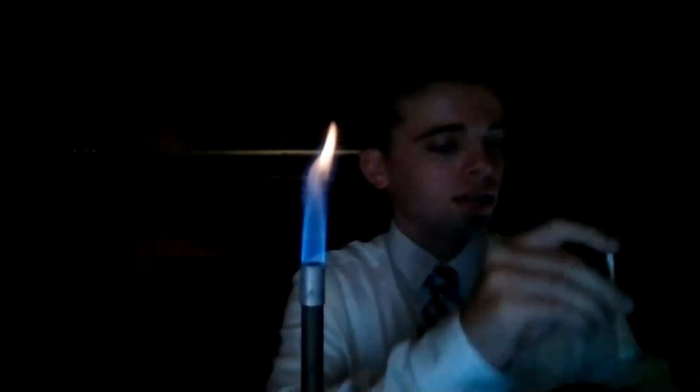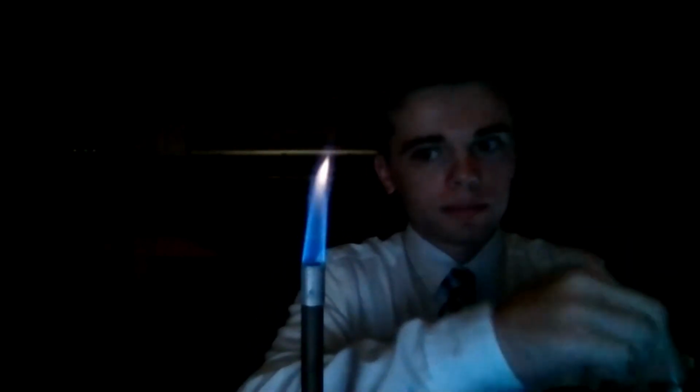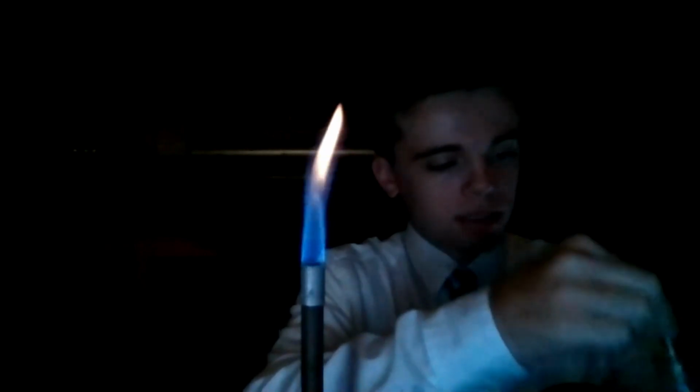Okay. Coat this lithium. Let's see what happens. Ooh. That's kind of cool. Are you guys seeing that one? The lithium's not burning too great right now, but do you see the red?